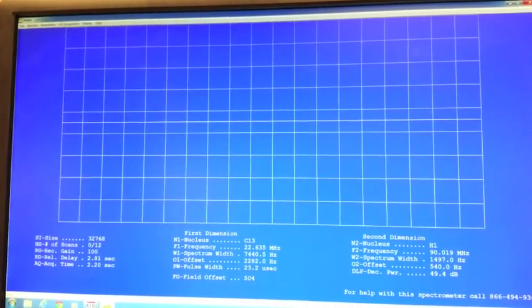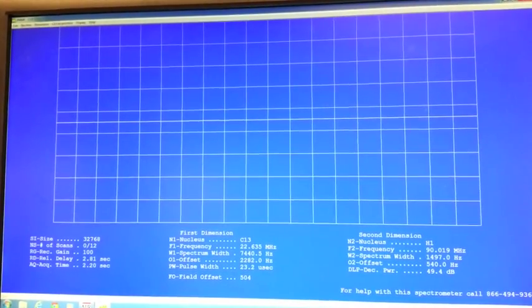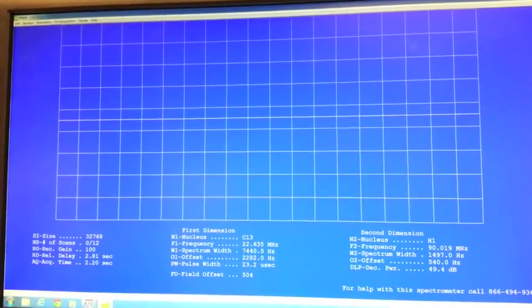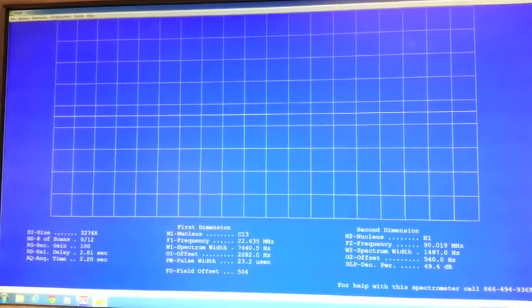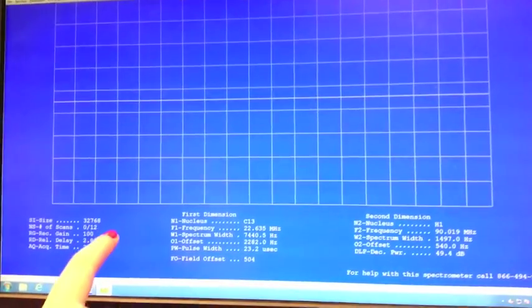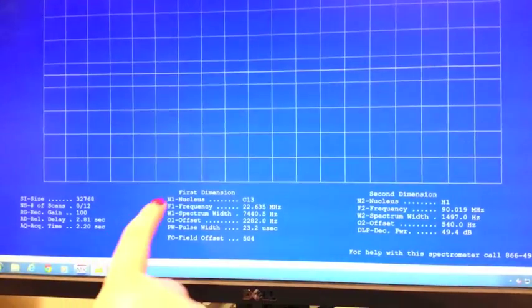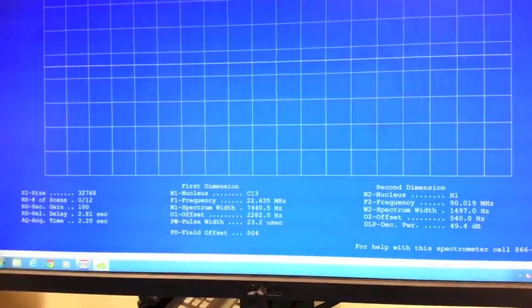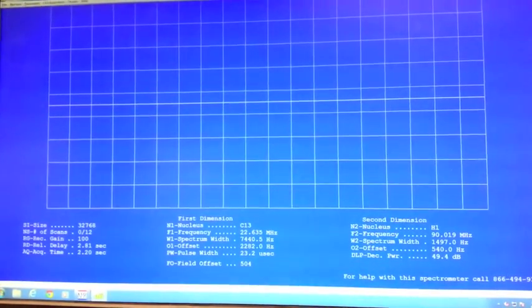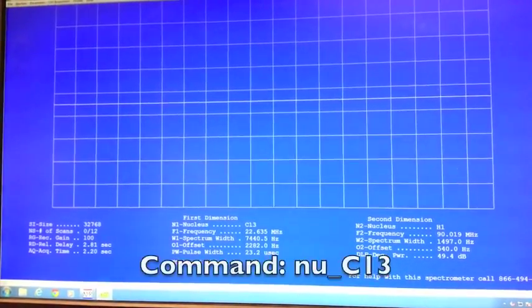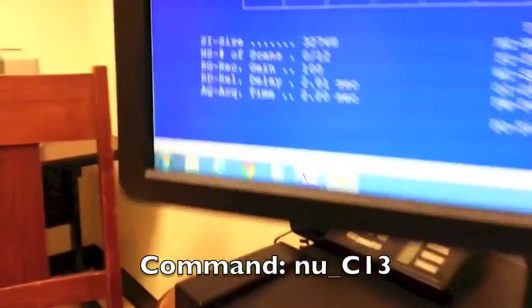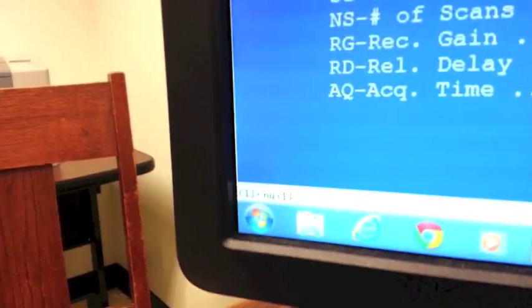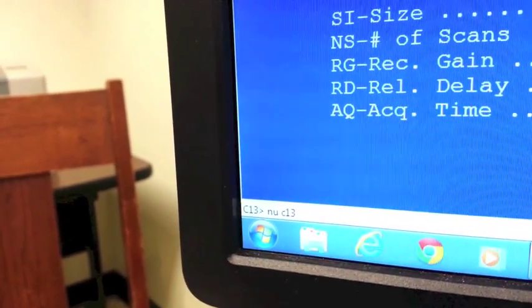Once you've inserted your sample into the machine and made sure it's spinning, you want to come over to the computer and actually take your scan. Whenever you're taking a scan, the first thing you want to check is the nucleus. In our case, we want to take a C13, so we want to make sure the nucleus says C13. If it didn't say C13, you can type in NU space C13 and hit enter.